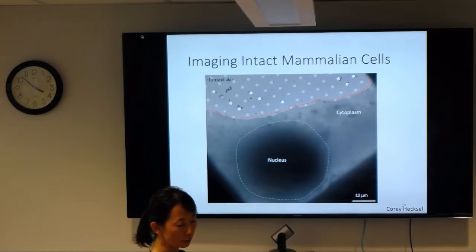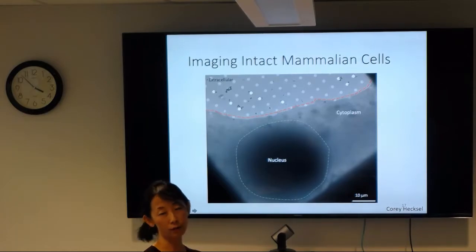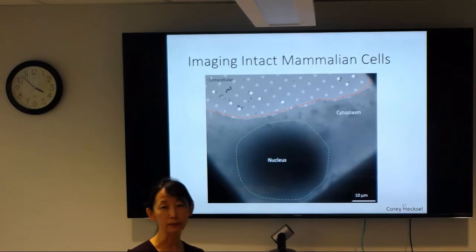For the edge, you will be able to just image directly. So if you're interested in some membrane complexes or interactions at the plasma membrane, you can just do cellular tomography directly. But if you're interested in the nucleus or something close to the nucleus space, then there are other tricks you have to do before you can take an image of it because it's too thick.